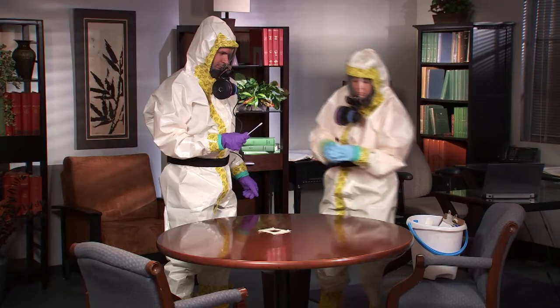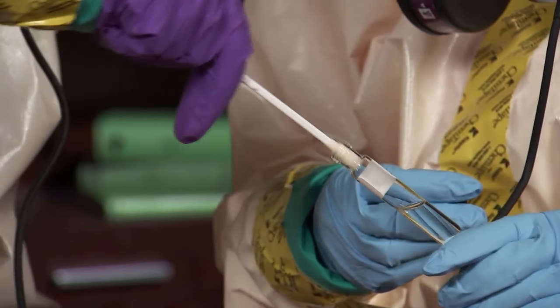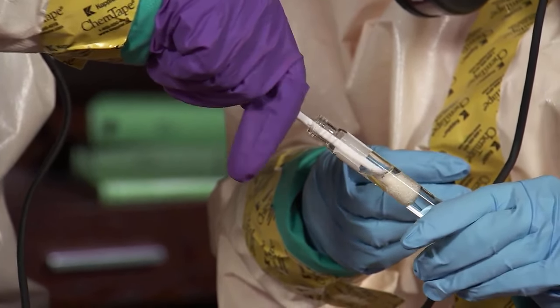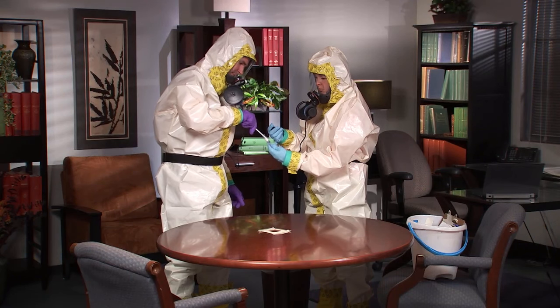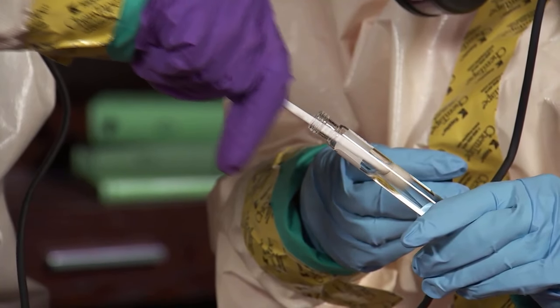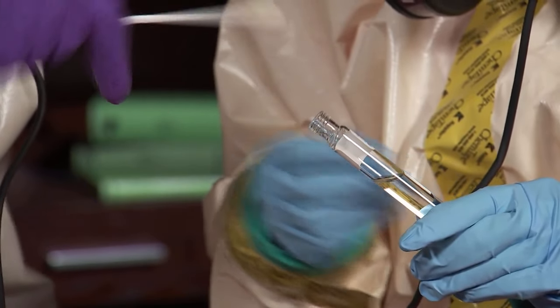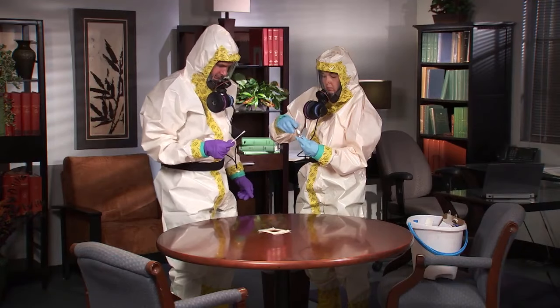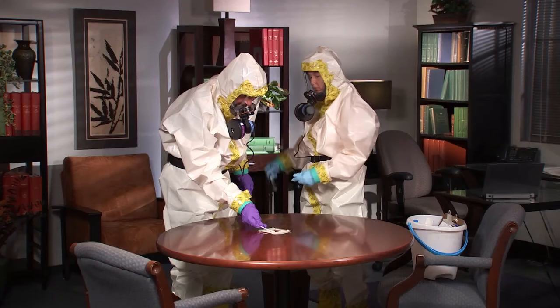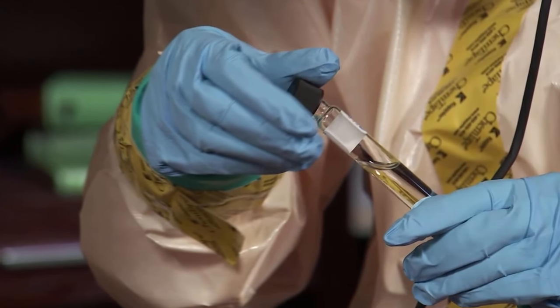If the swab is not pre-moistened, the sampler moistens it by dipping the swab into a container of buffer solution. The assistant opens and holds the container of solution for the sampler. The sampler presses the swab against the inside of the container to remove excess solution. After the swab is dipped in the solution, throw away the unused solution and container. Do not reuse the solution and container.